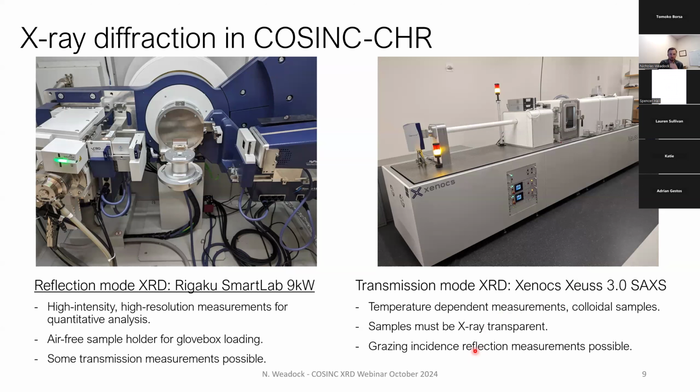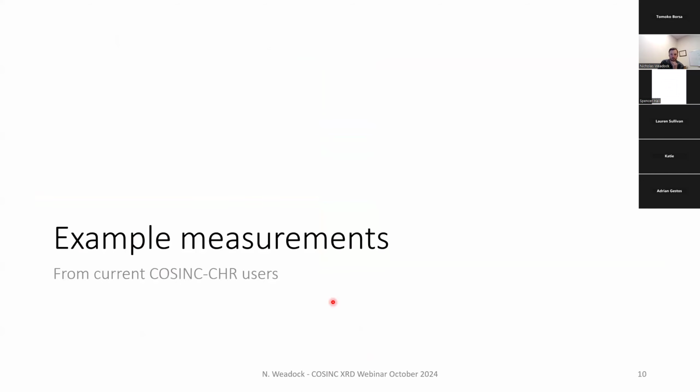But for the rest of this webinar, I'm mostly going to be focusing on data and measurements on the Rigaku diffractometer. So are there any questions up to this point? If not, I'll move on to highlighting some example measurements so you can see the capabilities that we have here.